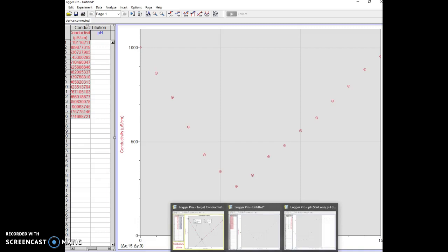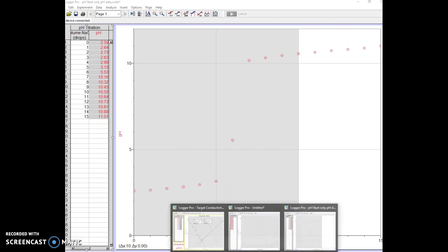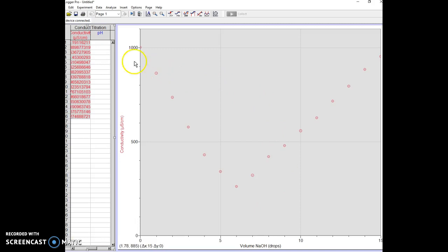We come down here to our original pH information, and we click on that graph, and all we have to do is paint this out, press Control-C to copy, or you could go up and you know how to copy things. And then we can go back to the program where we're merging our data and just paste it right in there with Control-V or an insert function.